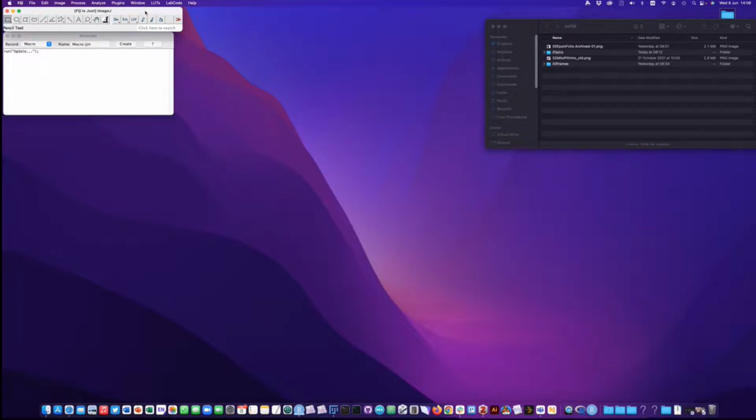So all my stuff is here, and when you install that update site, you'll get this little menu here called Lab Code, and there's a whole bunch of goodies here, but I'm mainly going to be showing you about Figure Maker today. So it's this menu here, but there's some other utilities and things here if you're interested. There's full details of how this works on my GitHub page where I'm developing ImageJ tools and things. So if anything's not clear, you can go and have a look there.